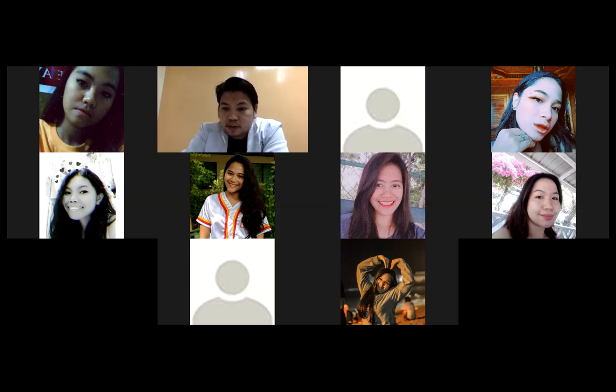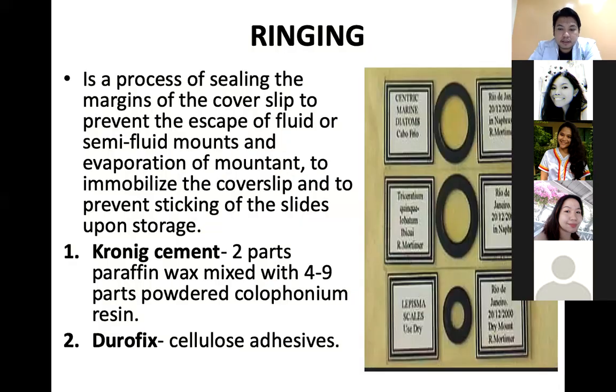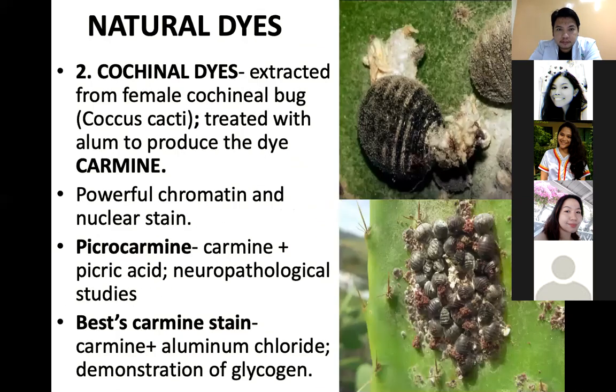Okay, so we have our last topic: staining. For the staining class, I think we have 3 topics for that type of slide. Okay, staining.